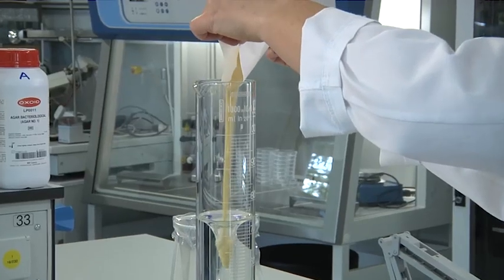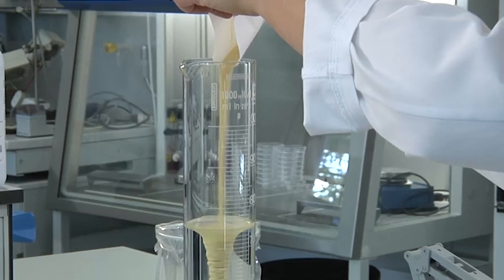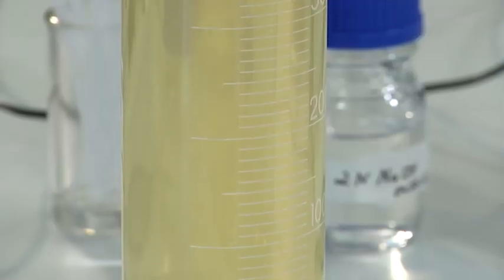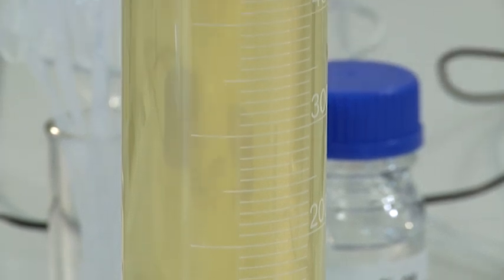While stirring the water, add the compound and stir until it is completely dissolved. Repeat the procedure with all solid compounds that have to be included in the media.